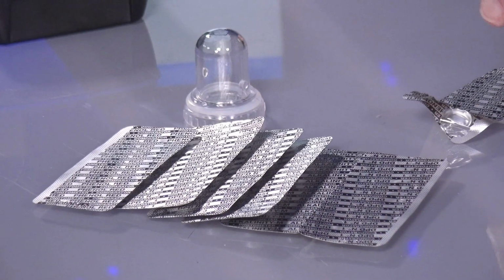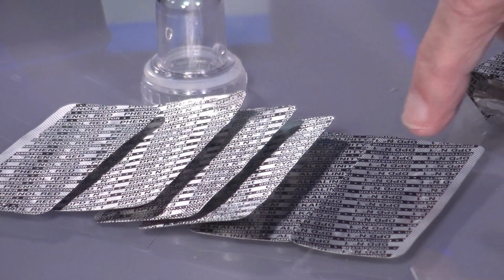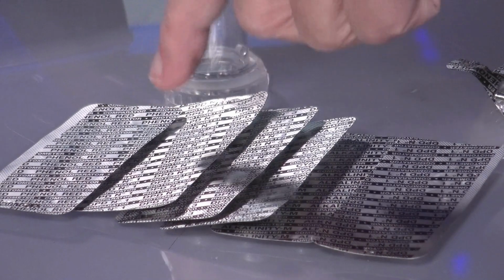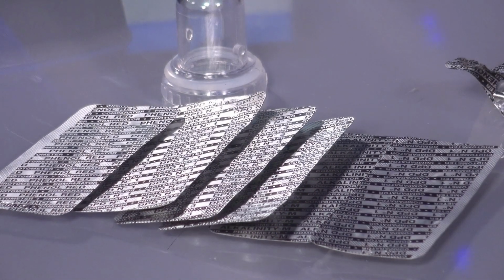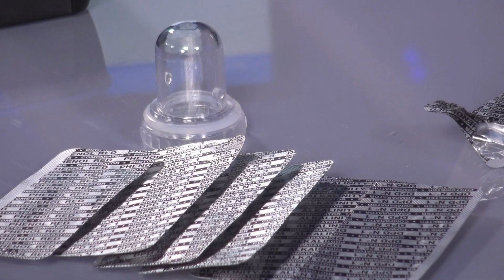Because I have different ingredients to determine, different chemicals here. If you look here, it says alkali, there it says DPD, phenol, and so forth. It reacts naturally differently with my sample. And depending on what the contents of the samples are, you can then, depending on the cloudiness in this special case, determine the wavelength, how high the concentration is, and what I want to measure.